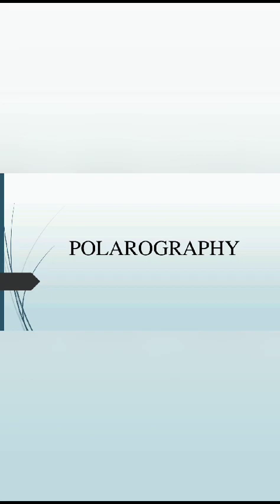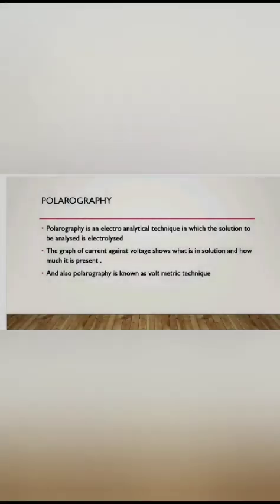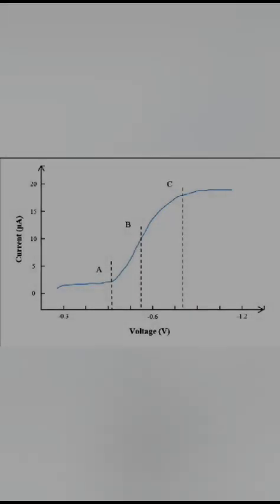Here we are going to see about the topic polarography. Now we are going to see about the definition of polarography. What is meant by polarography? Polarography is an electroanalytical technique in which the solution to be analyzed is electrolyzed. The graph of current against voltage shows what is in the solution and how much of it is present.